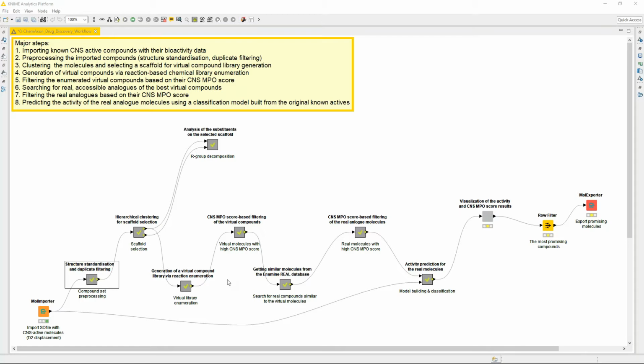Thank you very much. That's a good point. Thank you, Sarojit. One more thing: I have already executed the largest part of the workflow. However, you can also follow and run the workflow steps on your own computer, because I will also explain the key points and talk about what is happening.